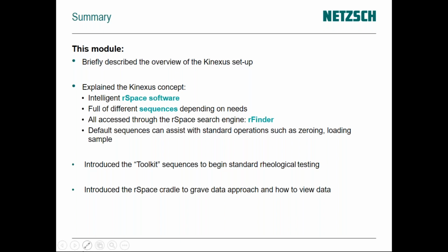So what we did here is we looked at the design of the RSpace software and the different types of sequences, and we looked at how the RFinder works, and zeroing and loading the sample, and then running the toolkit tests, and the RSpace capturing data cradle to grave, and showing you how to view the data after a test.